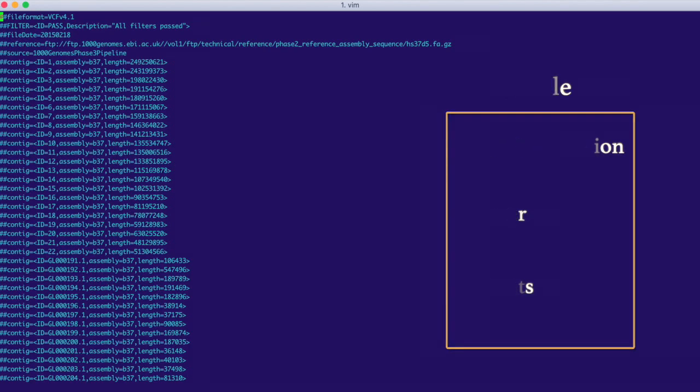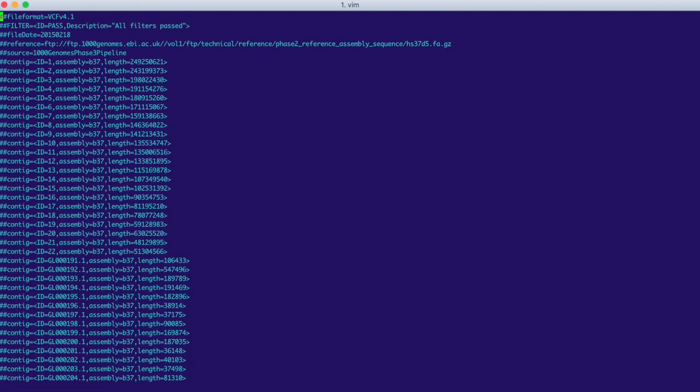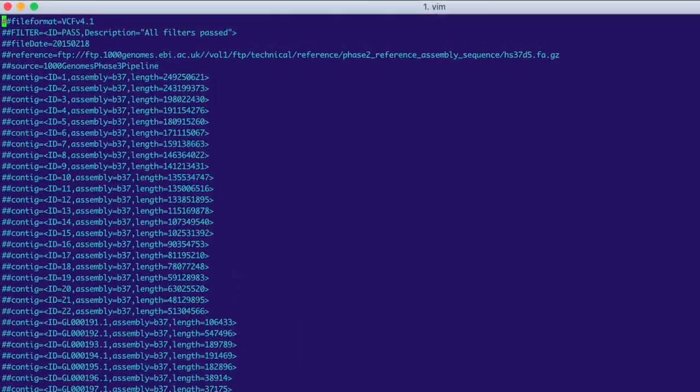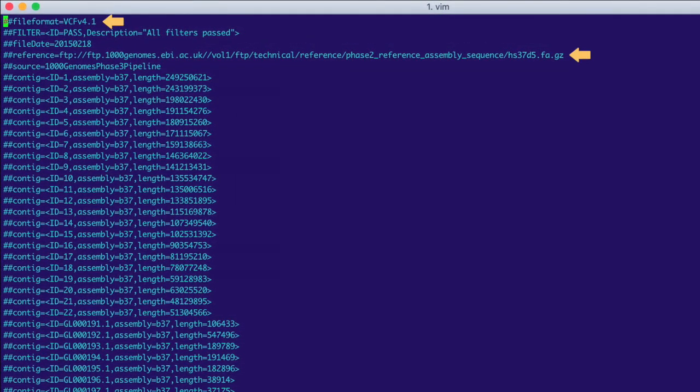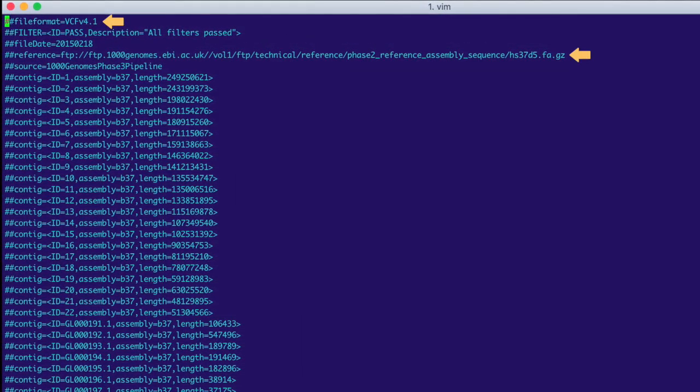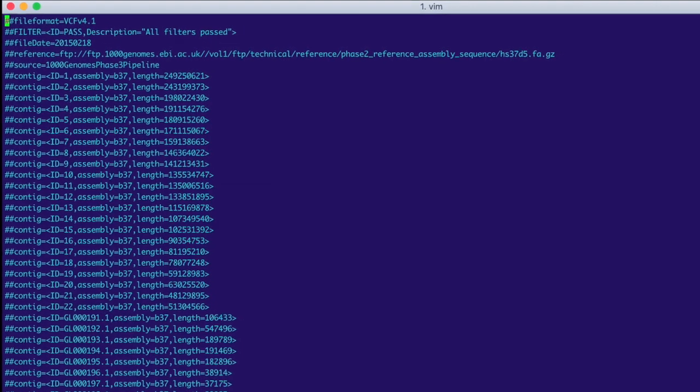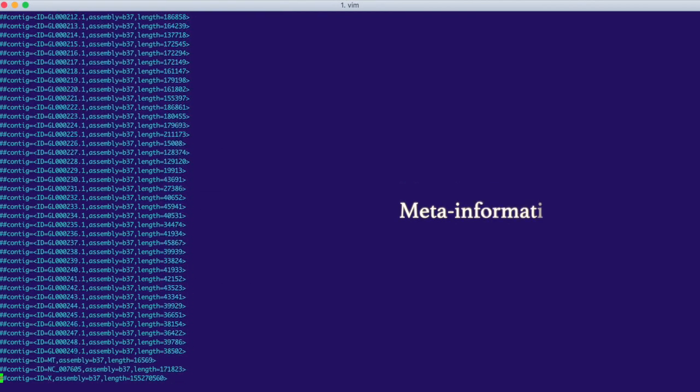What we see here are rows of meta information, which always start with a double hash. More importantly, we see the version of the VCF format and the reference genome that was used to call the variants in this file. Let's scroll down through the rest of the meta information.